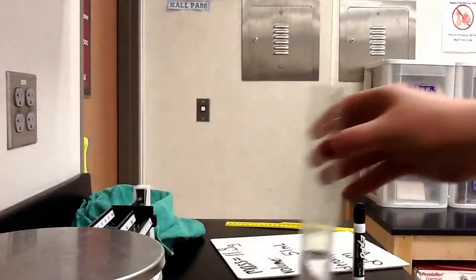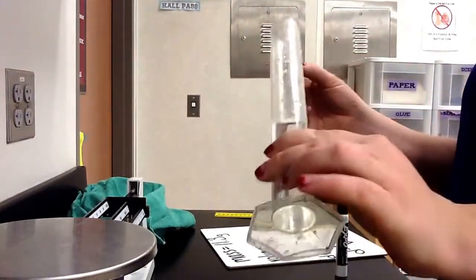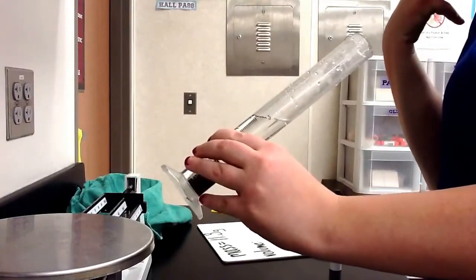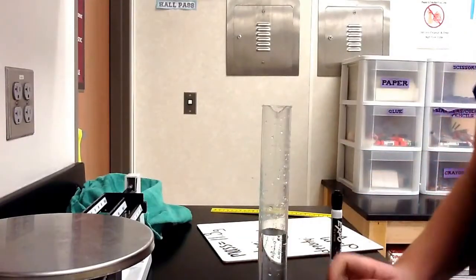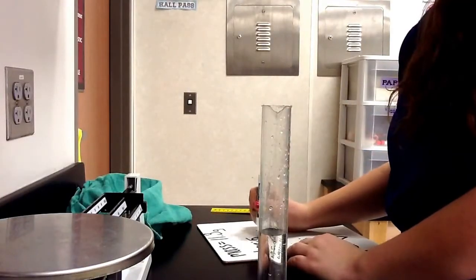Okay. So we've got this, and we're going to put our cylinder in here. We tilt it like this, so we can just slide it gently down the side, and it doesn't splash too much, so that won't ruin our volume measurement. I'm going to read the volume again. It went up to 59 milliliters.